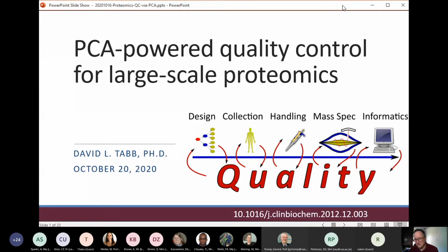Today I want to talk about a subject that we frequently look past in biotechnology. If you were to run a sample through a genetic sequencer for RNA-seq or for whole genome sequencing, you might think that you'd get the same result every time. That's not very true. And when we get to the world of proteomics that relies on mass spectrometry, we find that the degree of run-to-run reproducibility that we see can frequently be quite problematic.